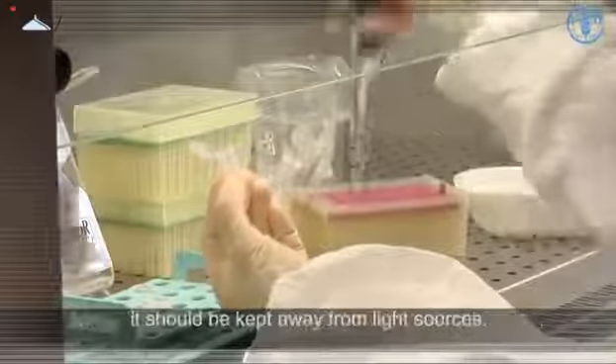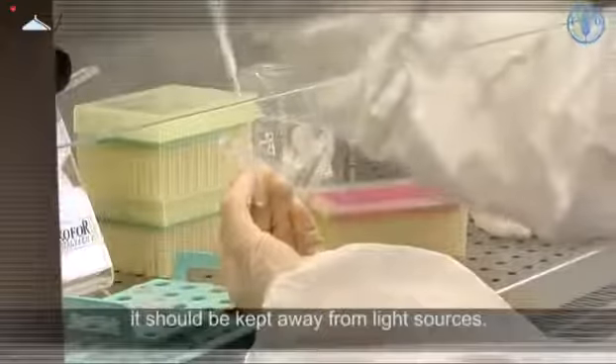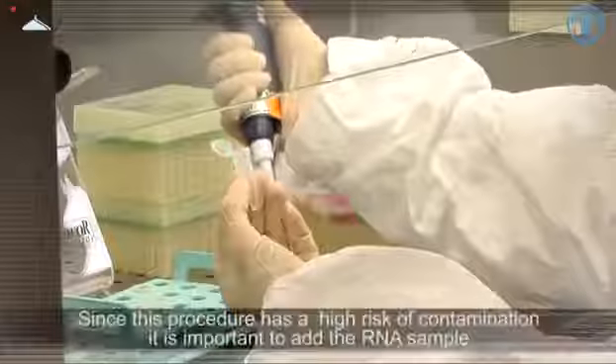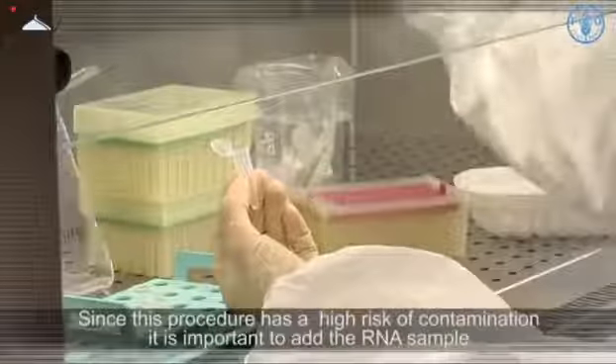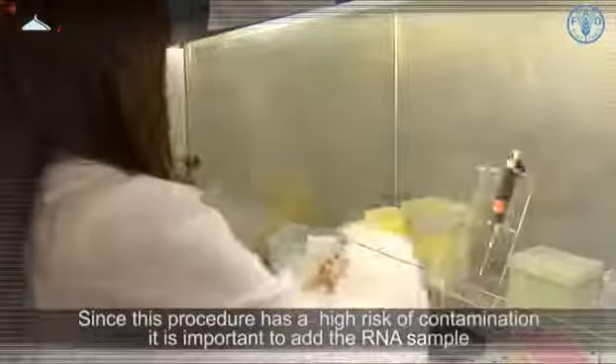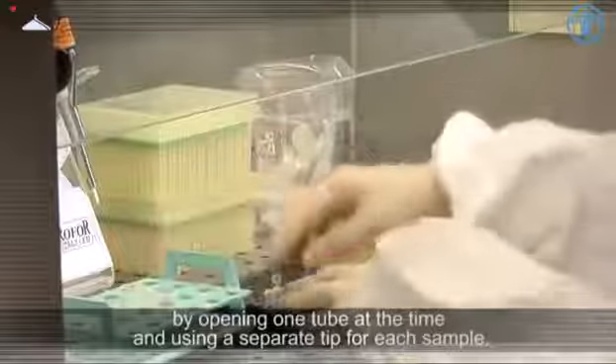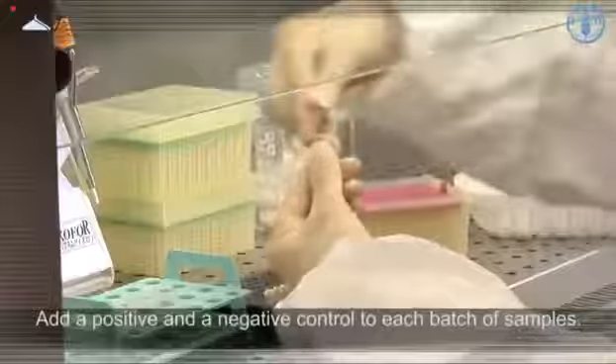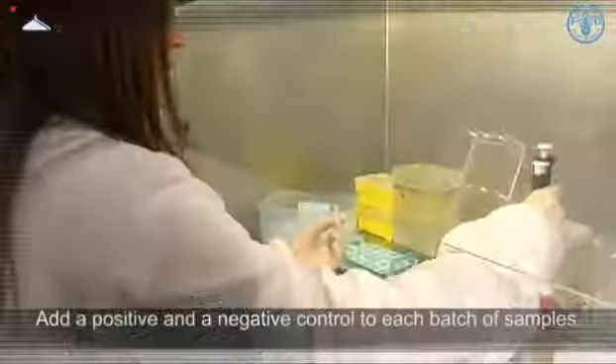Note that if the master mix contains fluorescent probes, it should be kept away from light sources. Since this procedure has a high risk of contamination, it is important to add the RNA sample by opening one tube at a time and using a separate tip for each sample. Add a positive and a negative control to each batch of samples.